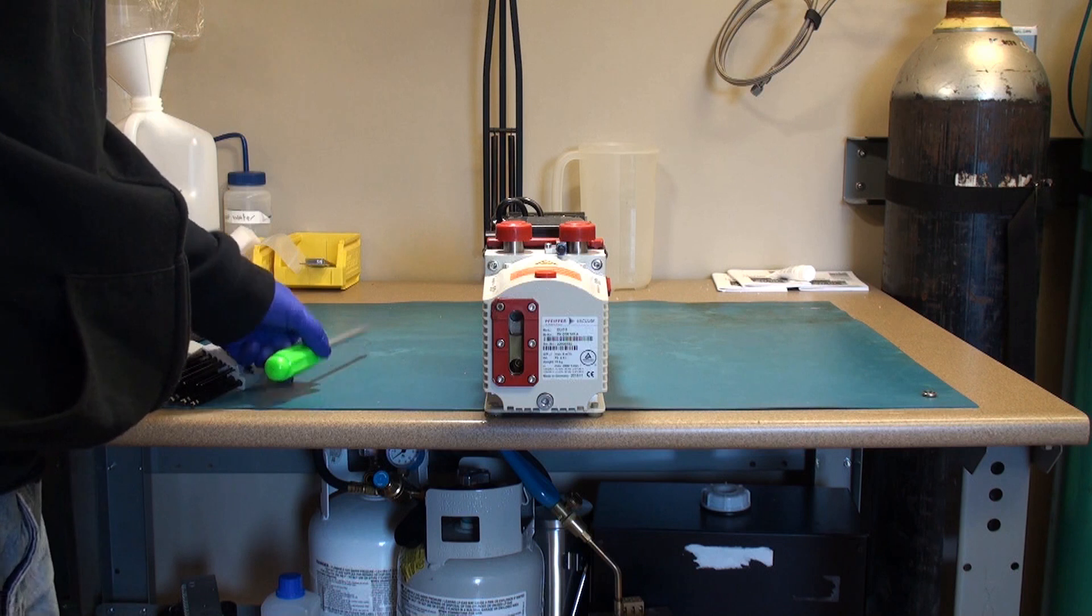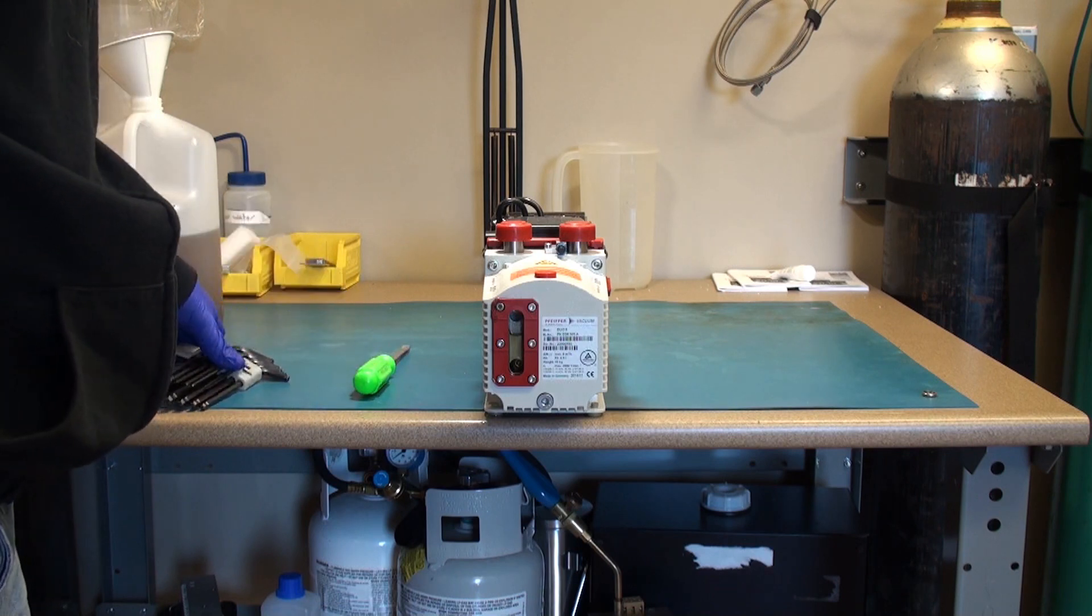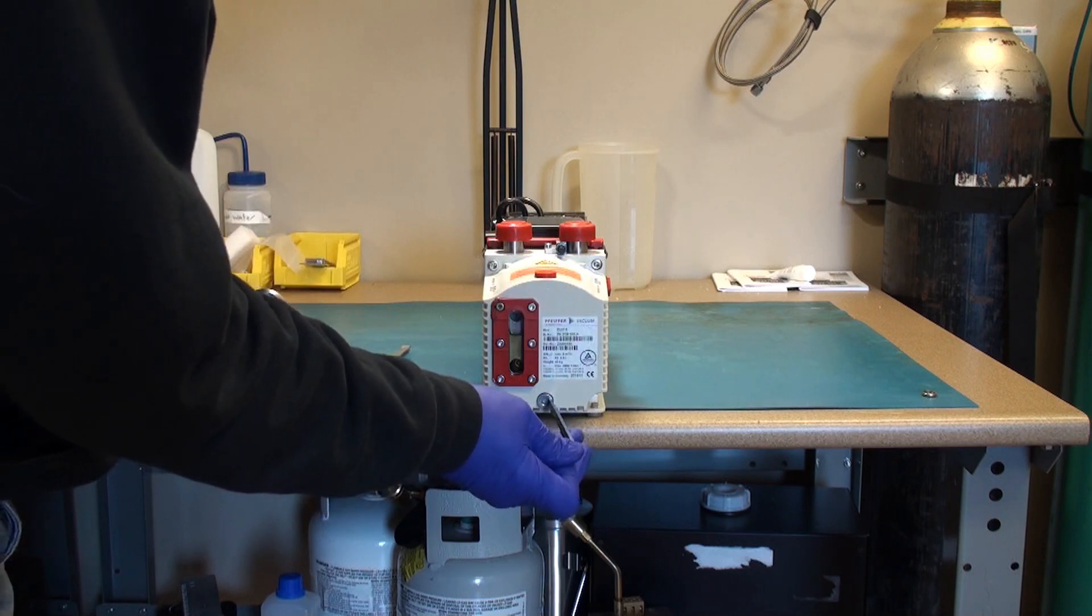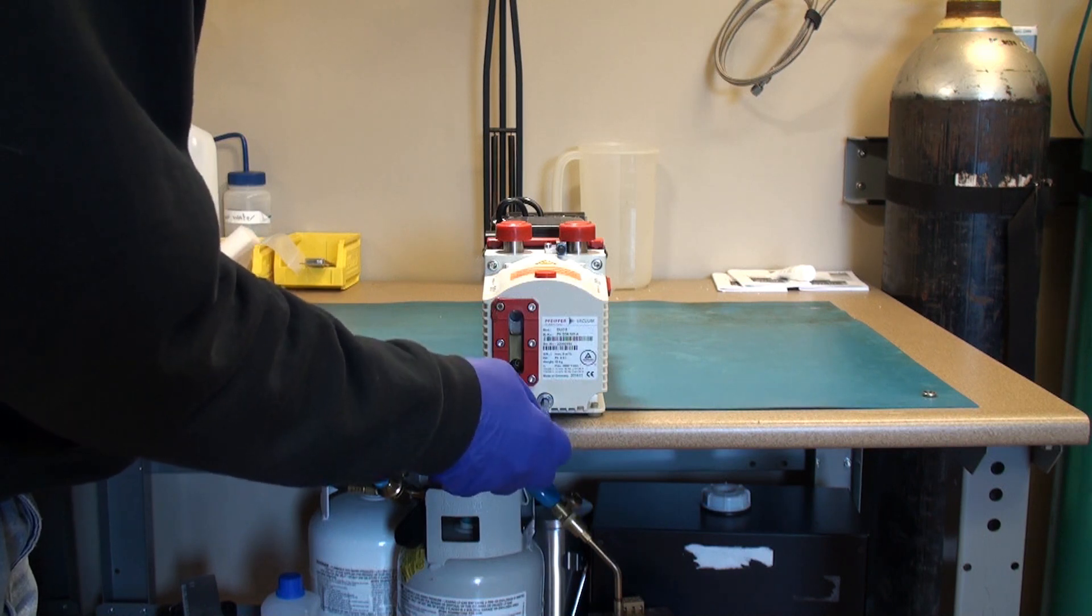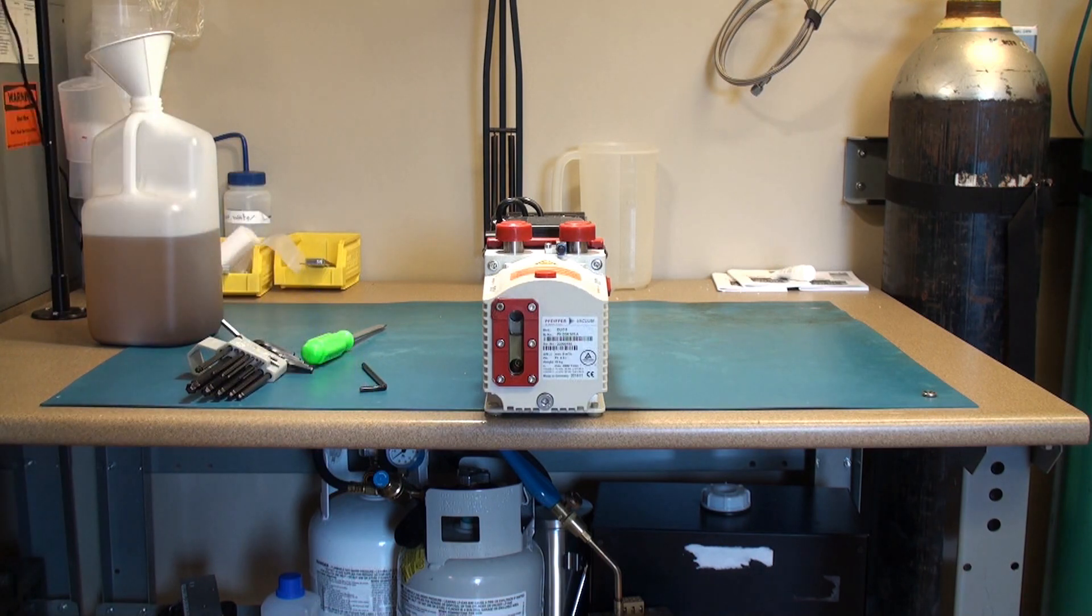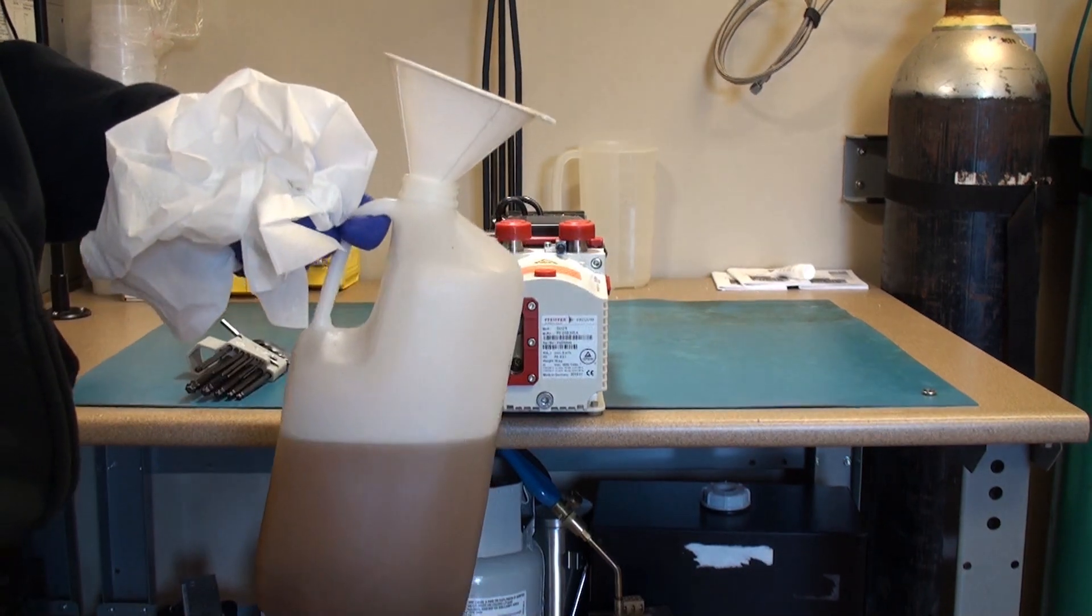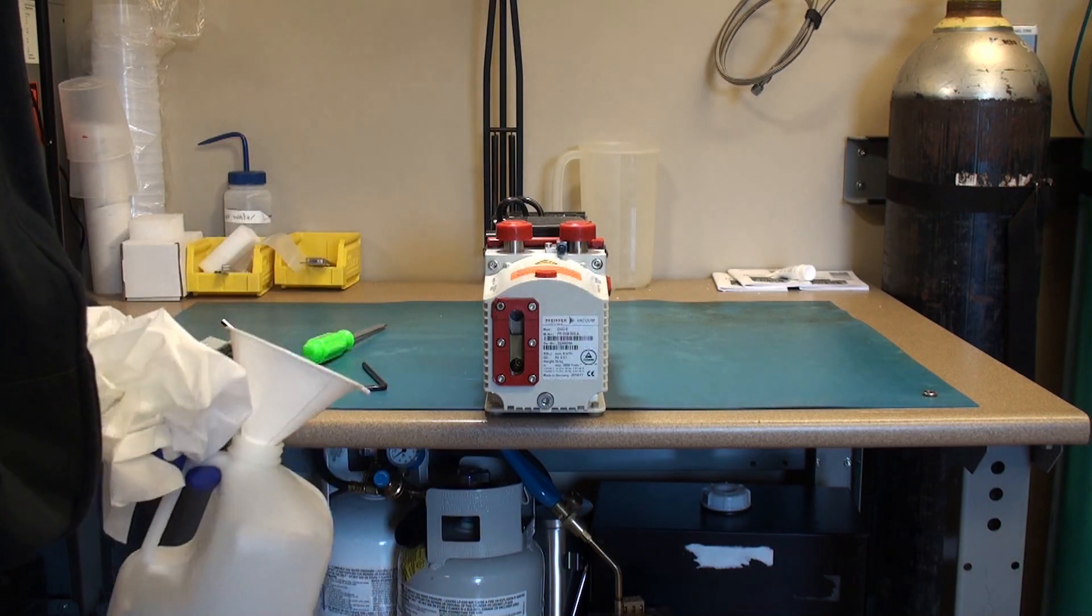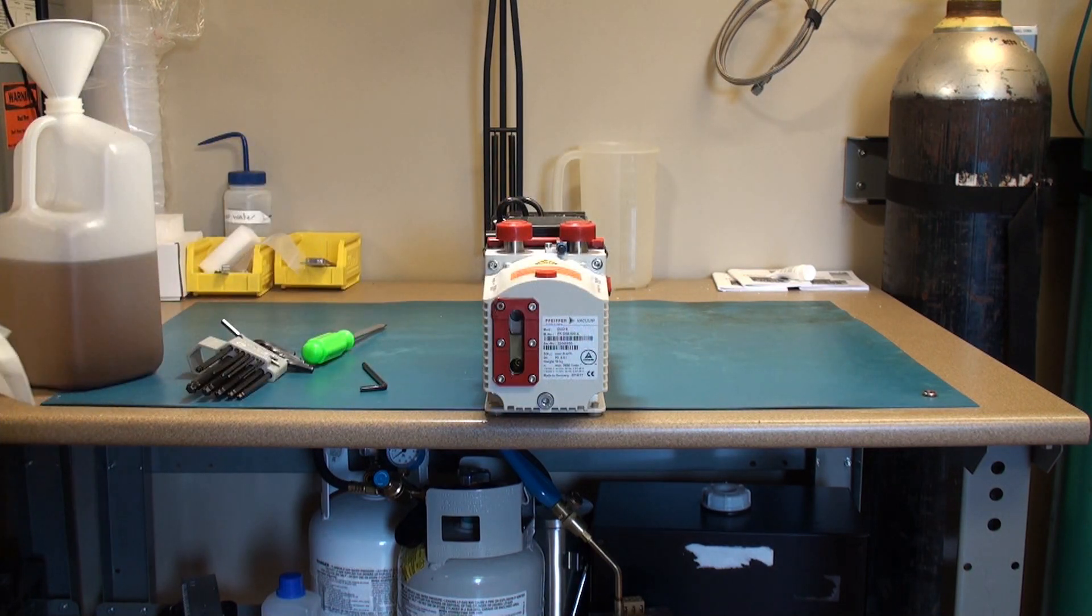Items that you need for this pump is a large screwdriver, a set of metric allen keys. In particular you need a five millimeter allen key to open the drain plug. You would need a waste oil container like the one I'm holding here with a funnel to catch the waste oil, and some Kim wipes just in case you make a mess.